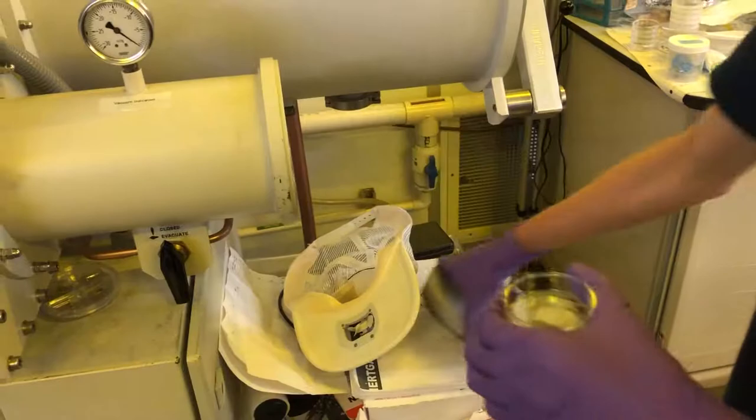After it finished, we took our sample out carefully and brought it over to the vacuum chamber. We placed our samples in the vacuum chamber to evaporate the solution and reduce the grain size of the perovskites, allowing for better consistency.